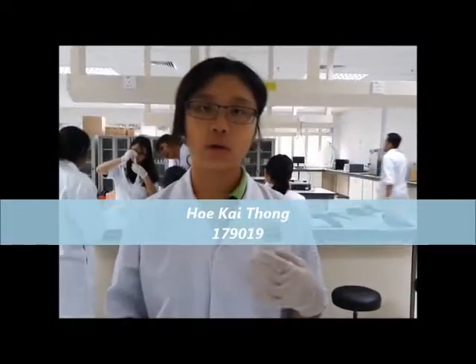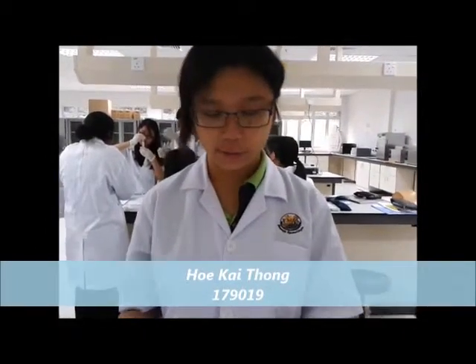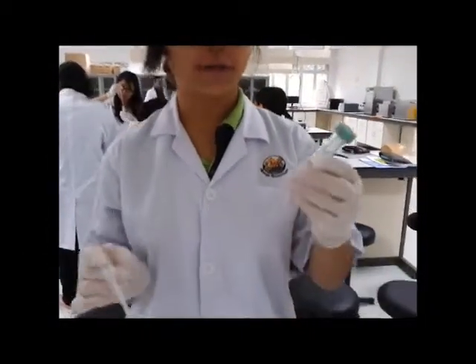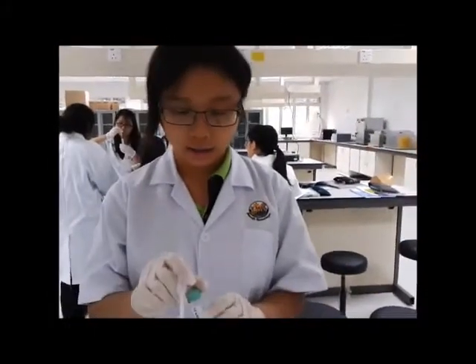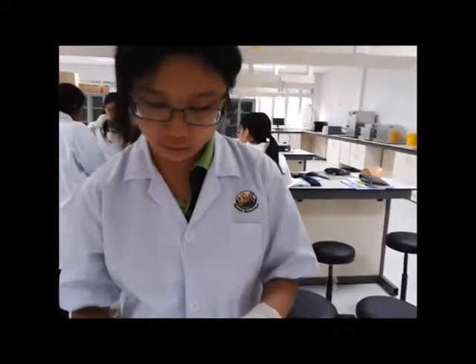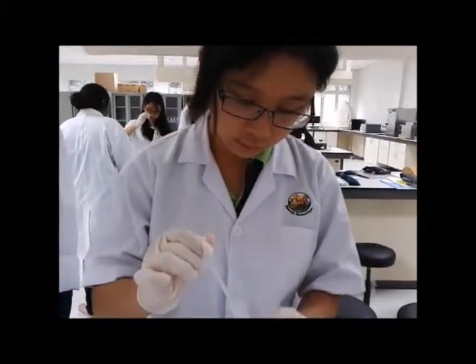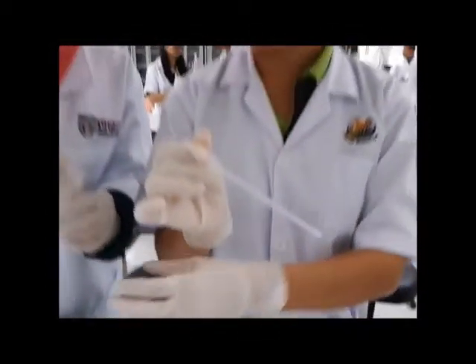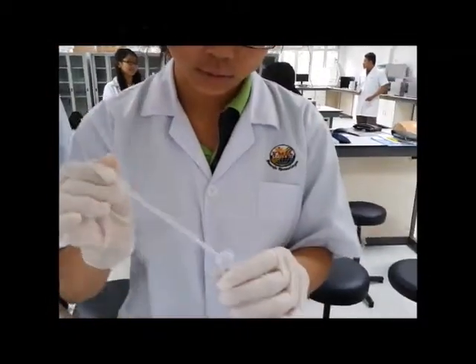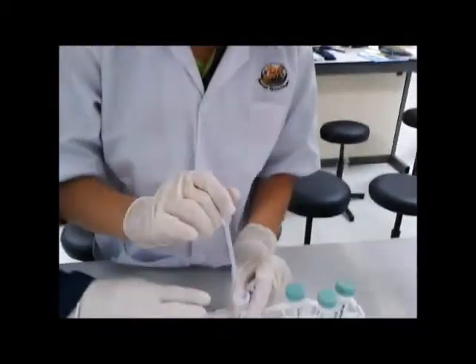Good morning, I'm Ho, and today I'm here to continue the steps of our experiment. First, you have 1.5 millimolar of the substrate, and you have to pipette 2 milliliters into the enzyme reaction tube. Since the pipette is maximum for 1 ml only, you have to pipette twice.